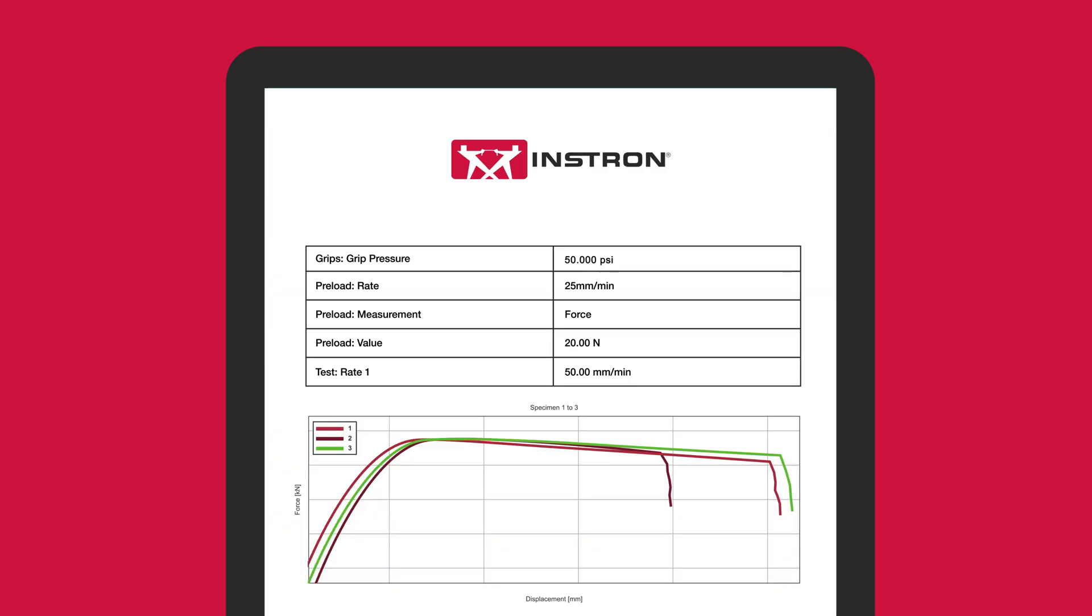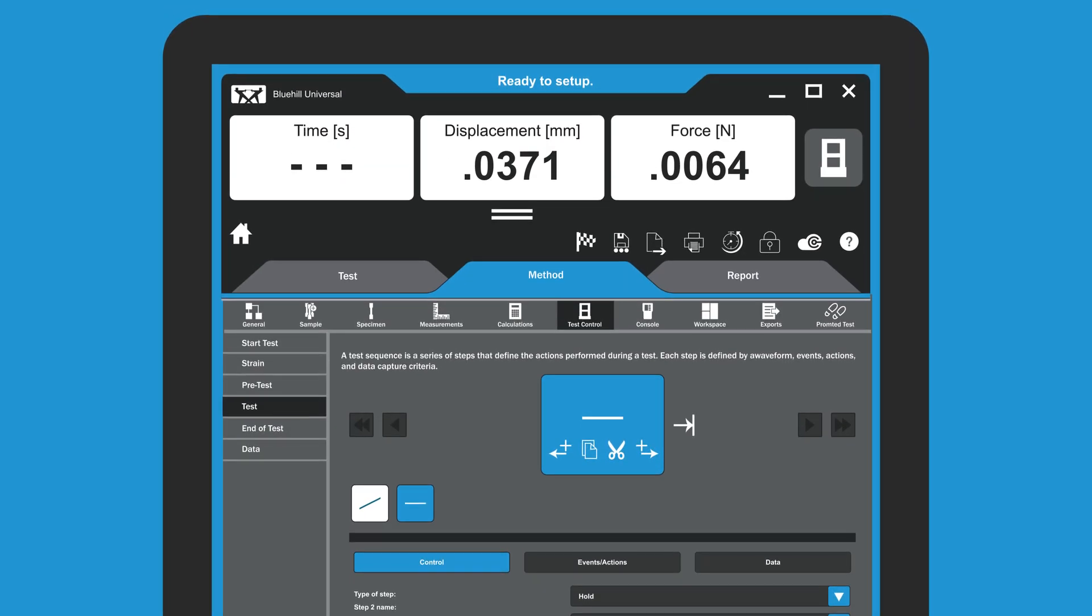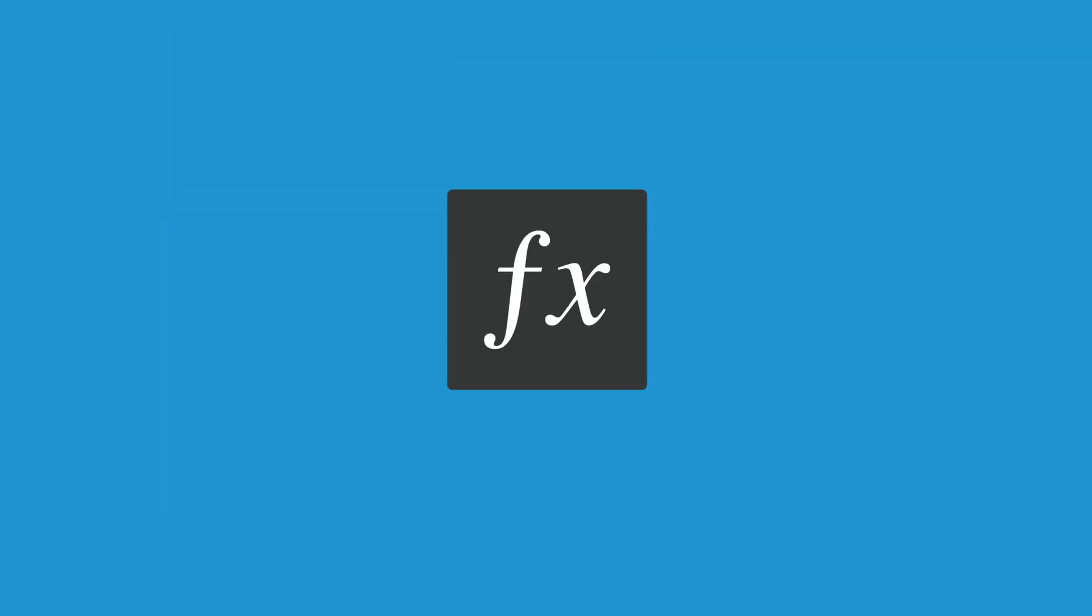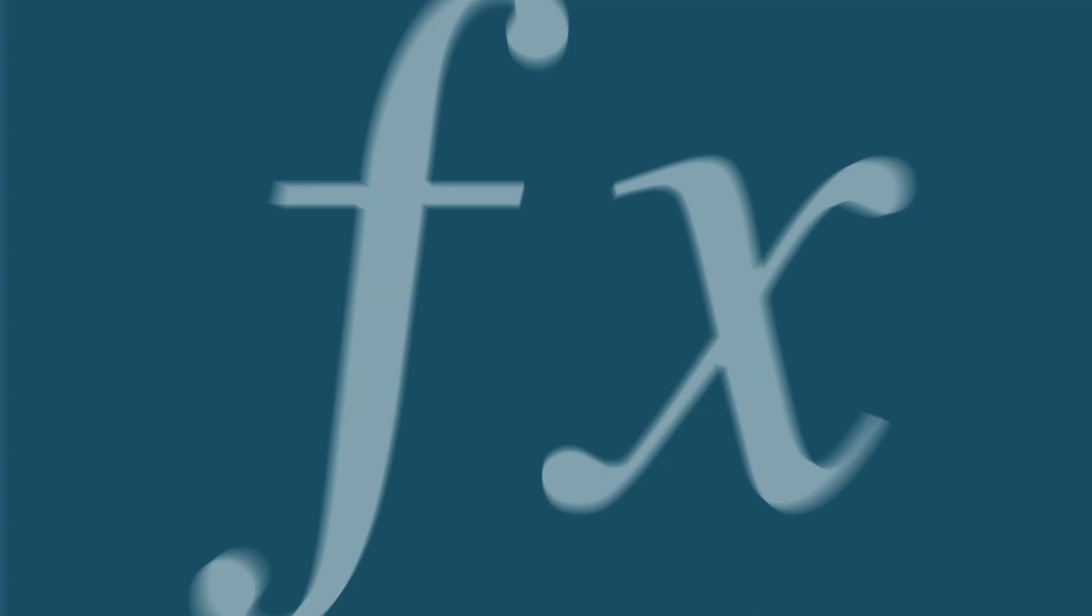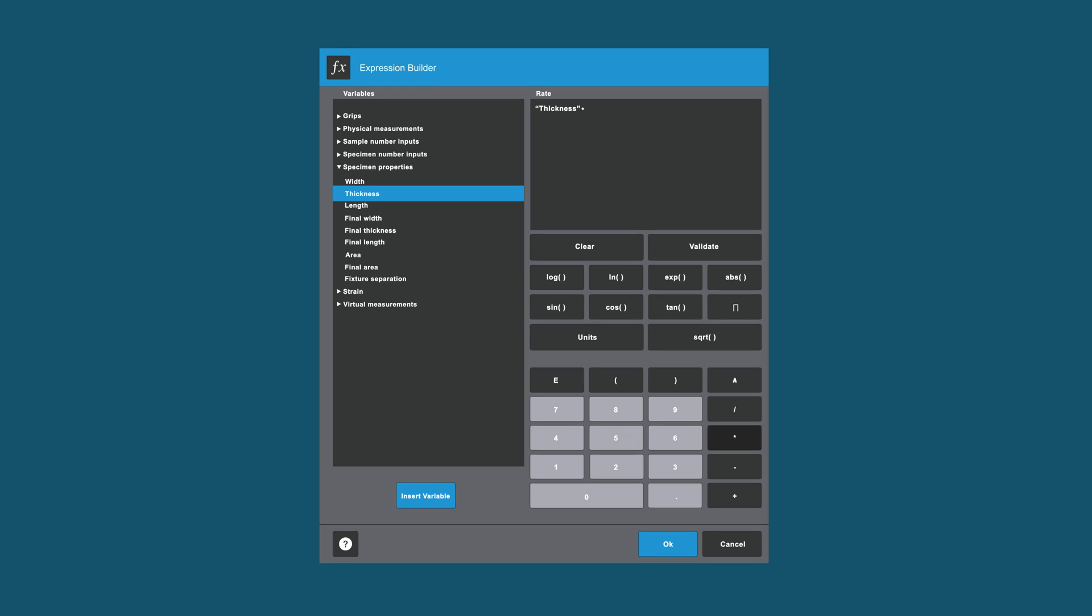Bluehill Universal offers smarter tools like Test Profiler for creating multi-step testing sequences or the Expression Builder tool for writing your own functions to define test events, calculations, and more.